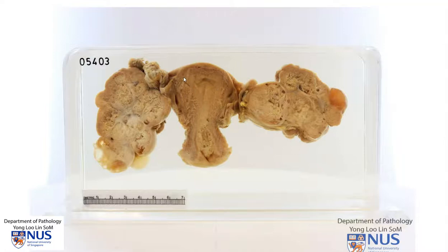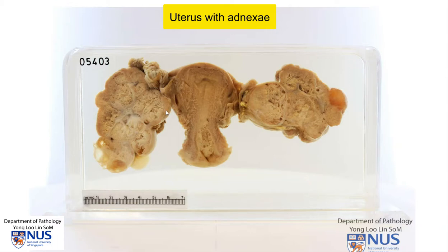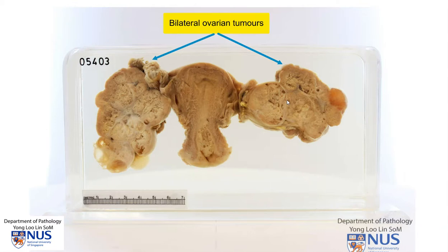Hello, this is a cross pathology specimen comprising the uterus with the uterine cervix and bilateral adnexal structures. The very obvious pathology is that both the adnexae are very enlarged and we're looking at the cut surfaces of bilateral ovarian tumors.